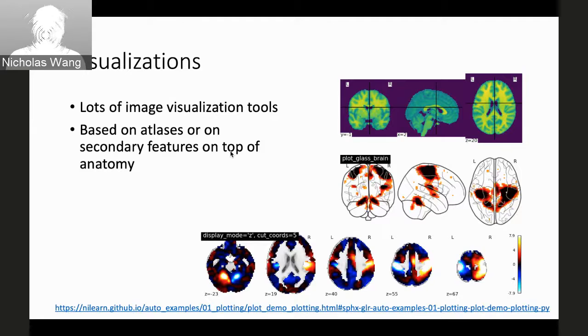It's easy to kind of assume that your pipeline worked correctly, but sometimes, if you forgot to align something correctly, or the layers of the mask don't line up correctly, it's just a nice sanity check to be able to take a look at a single image and say, this is what I'd expected to be investigating, and the values make sense to me.